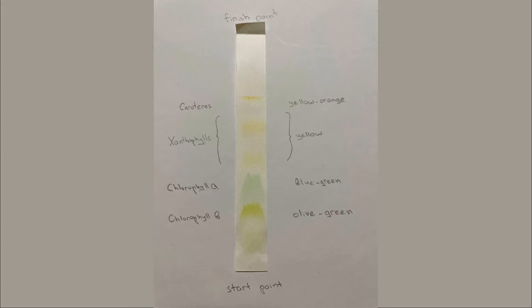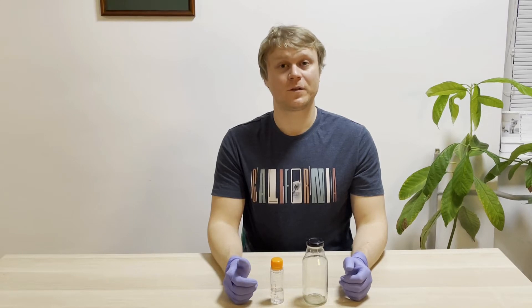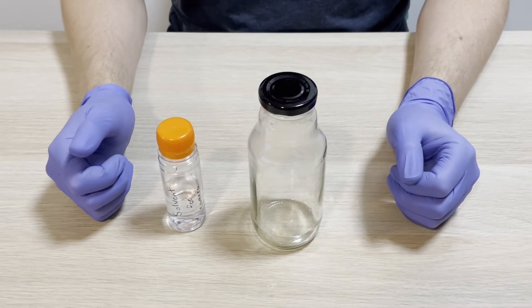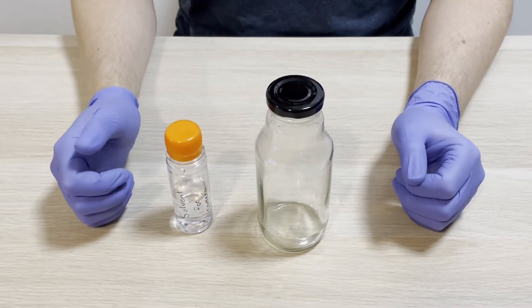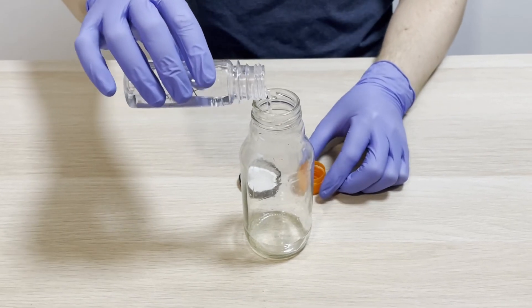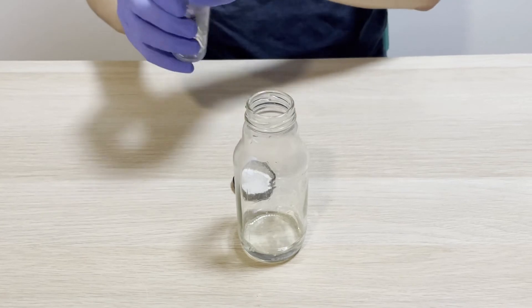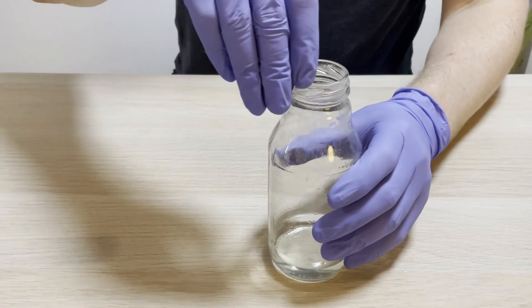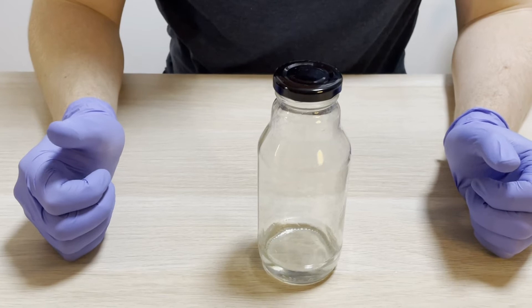Chromatography is a method of separation of different molecules in a mixture. The mixture is dissolved in a fluid which carries molecules of interest via capillary action through a filter paper. First of all, let's prepare the bottle with solvent where chromatography will take place. We will fill the bottle – which we will call a camera from now on – with already prepared solvent up to one centimeter. It is important to keep our camera closed in order to prevent evaporation of liquid and to better maintain the separation of vapors.